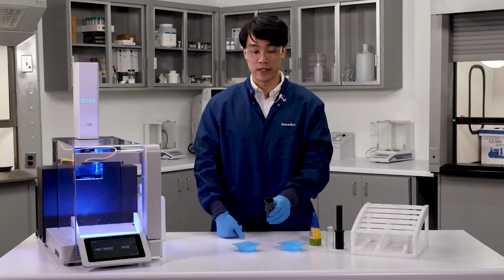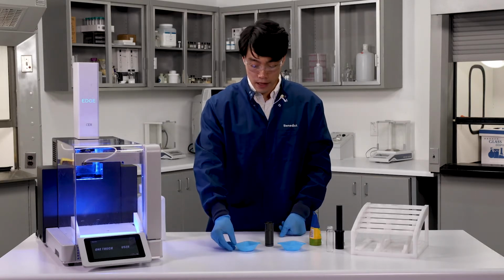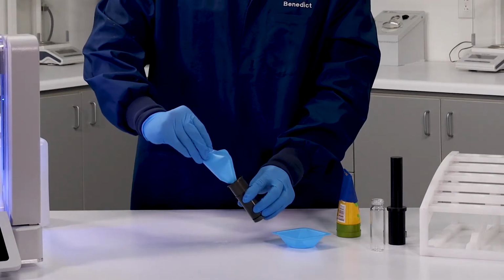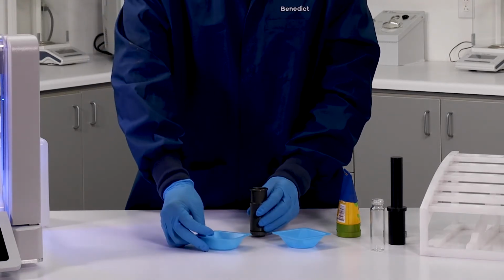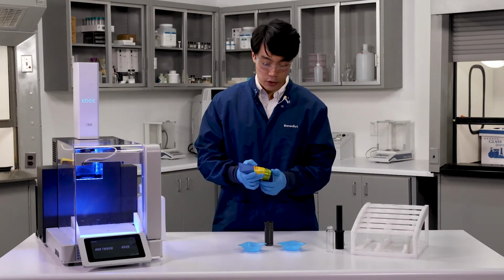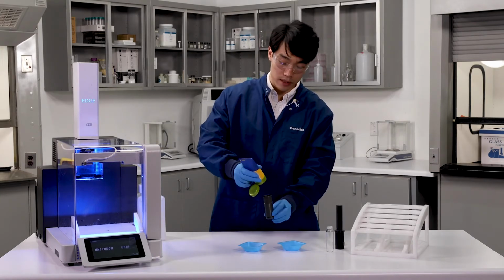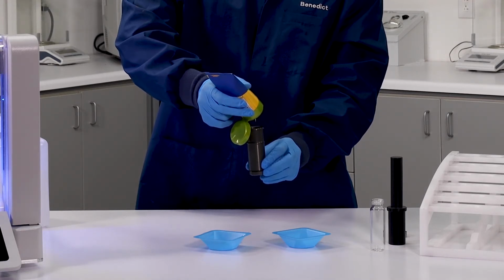And now that our sample cell has been prepared, we'll go ahead and add in some Q matrix Hydra to help ensure that this sunscreen stays inside the Q cup during extraction. So go ahead and add in our pre-weighed amounts of Q matrix Hydra. And with that inside the sample cell, I'll go ahead and squirt in some of this sunscreen. Normally you would pre-weigh your sample and pipette it in, but I'm going to just squirt some in on top.